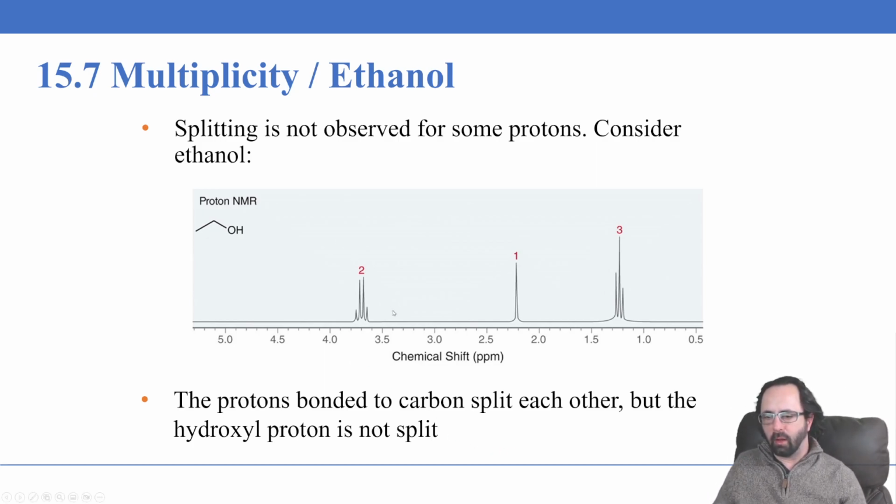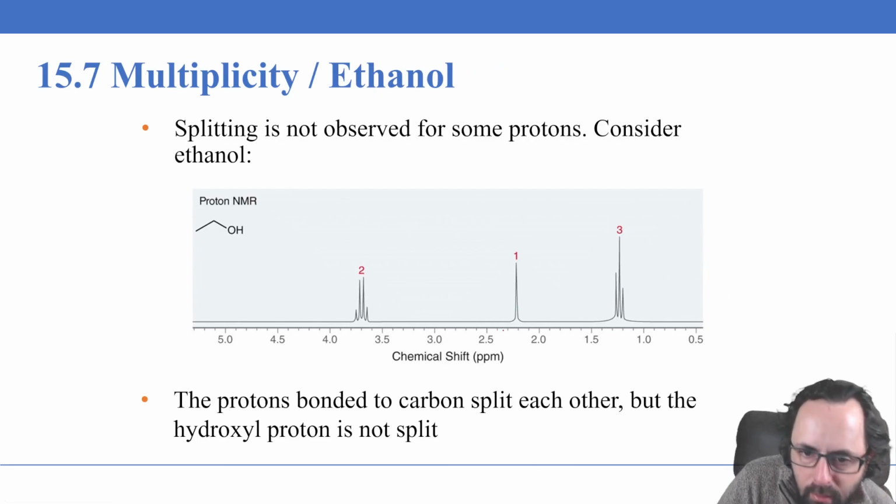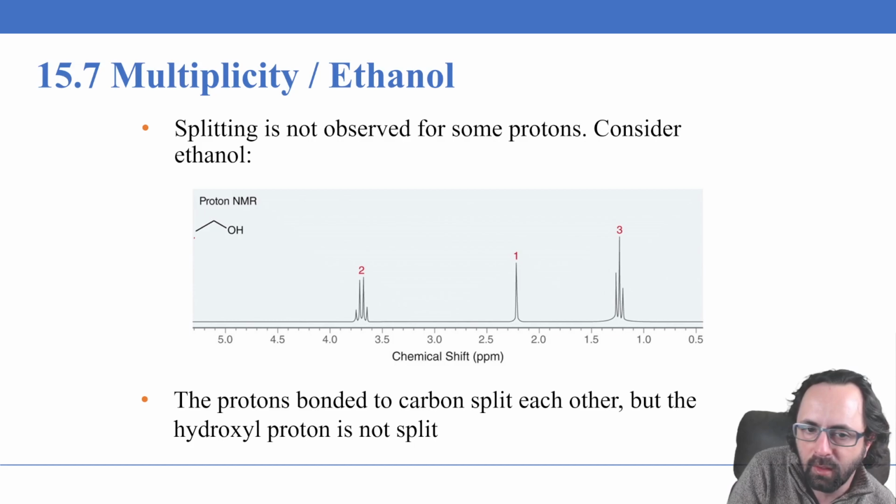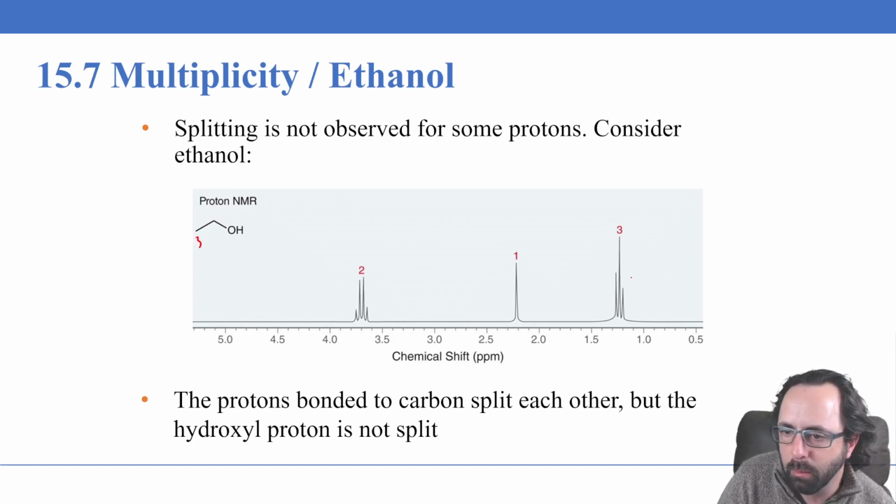Yeah, we're going to have a splitting that is different, right? We have the proton, this one here. We have the chemical shift here. Notice the chemical shift is very low for this one, which is called number 3. It's split like a triplet. This one is number 3, and it represents 3 protons too, so that's why it's larger.